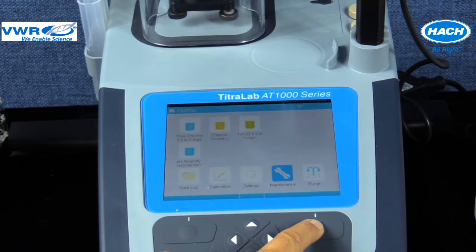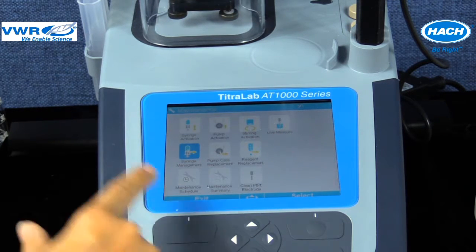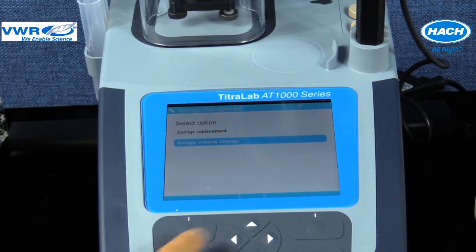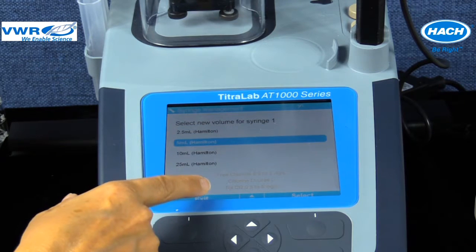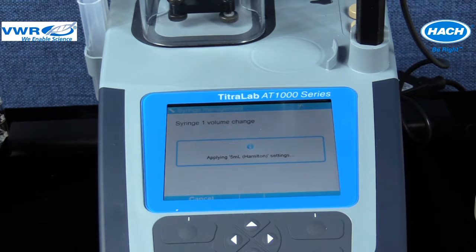First, select the maintenance icon. Then, syringe management. Then, syringe volume change for the correct syringe port in use. And then select the correct syringe volume desired from a list available. The software will then apply the syringe volume change, the volume will be updated, and OK can then be selected.